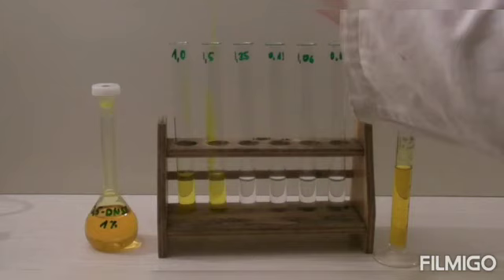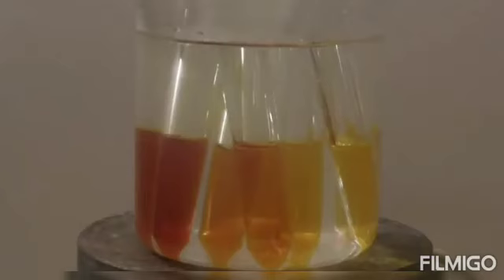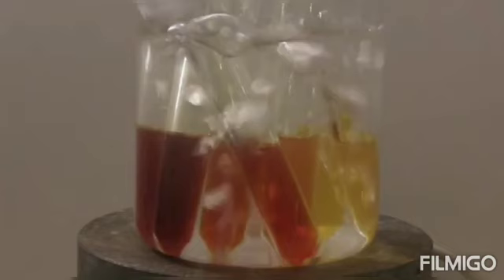Then in each test tube we have to add the DNSA reagent to determine the concentration of glucose in each test tube. After addition of DNSA in each test tube, keep the test tubes in the boiling water bath. Here we can observe the change in color as per their concentration.